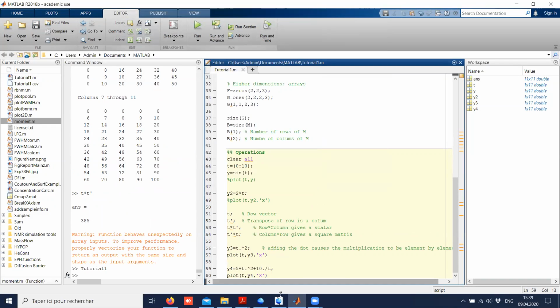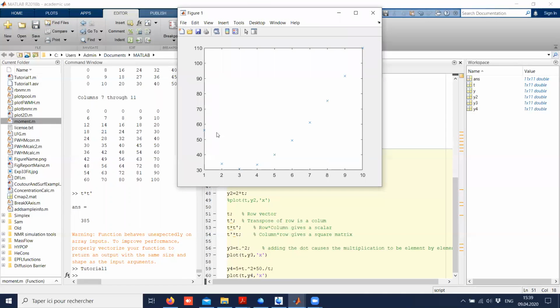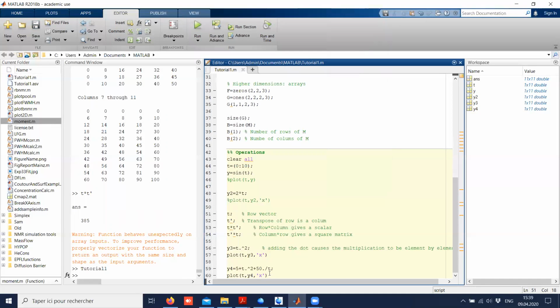Let's put something bigger so that we see better what is going on. So we start at somewhere between 50 and 60, and this is our function now. I had to add this point here because the division could be ambiguous.